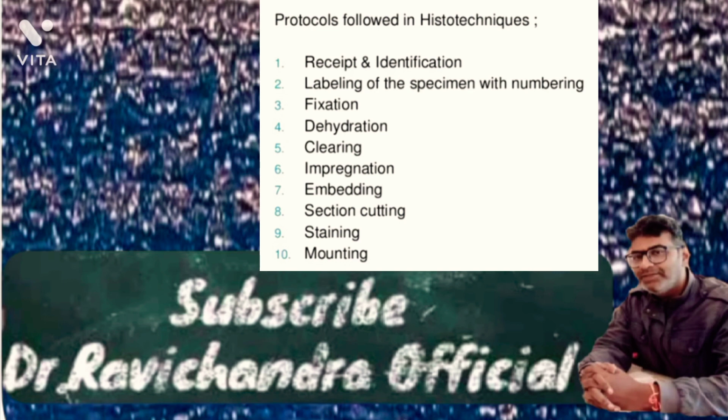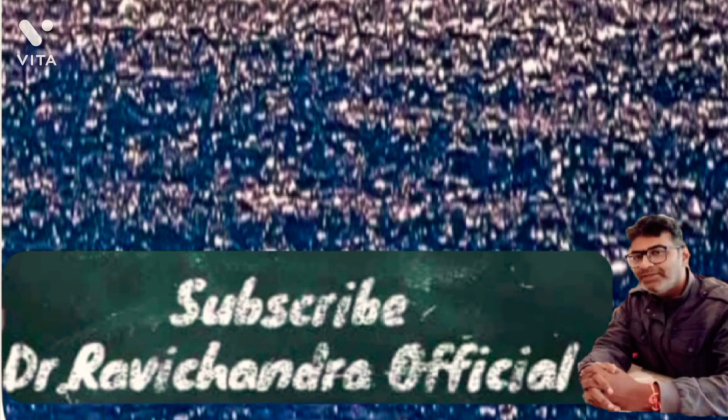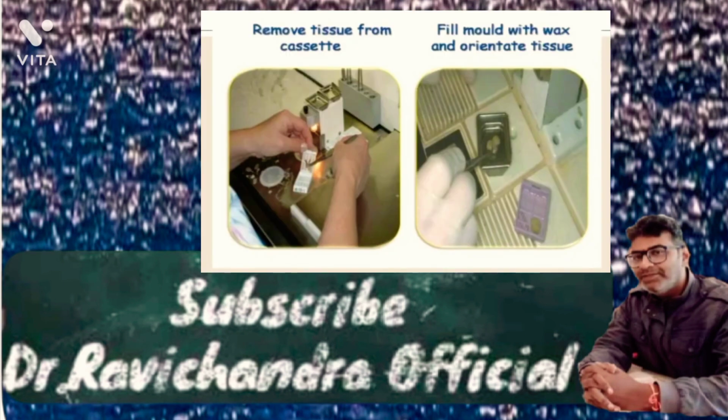Automation consists of an instrument that moves the tissue around through the various agents on a preset time scale. Embedding. After tissues have been dehydrated, cleared, and infiltrated with embedding materials like paraffin, agar, or gelatin, they are then hardened.